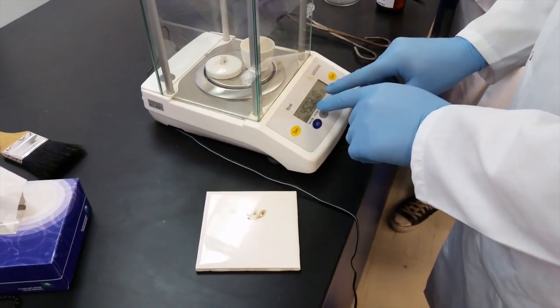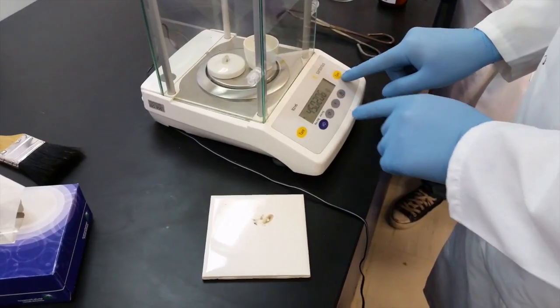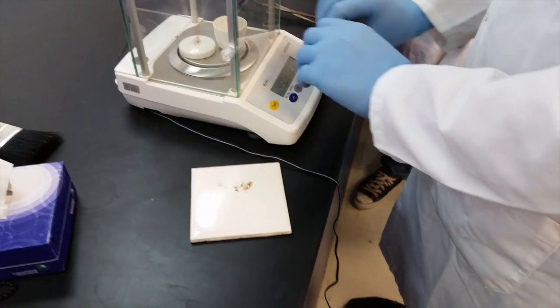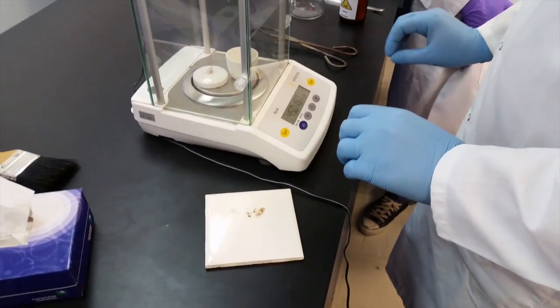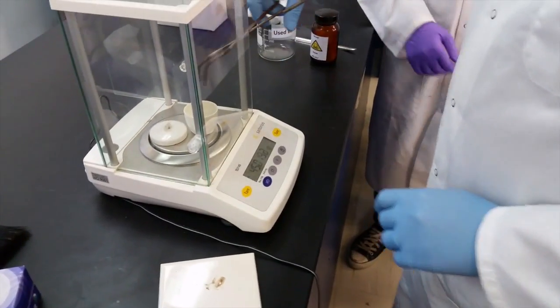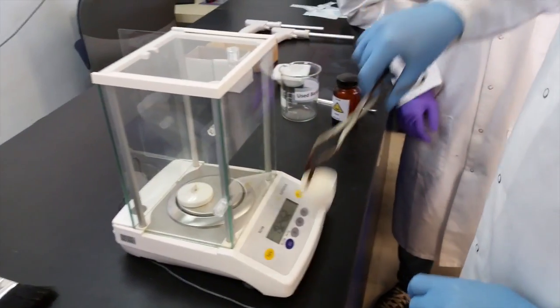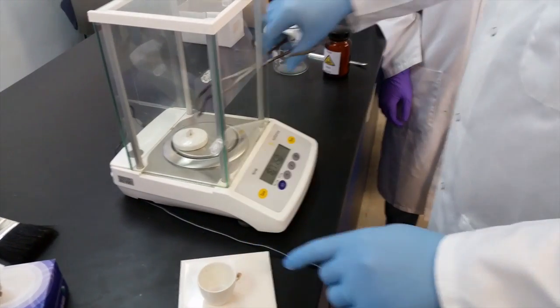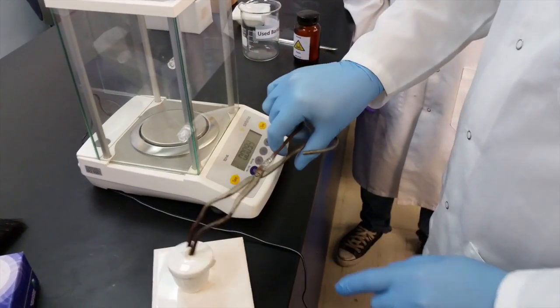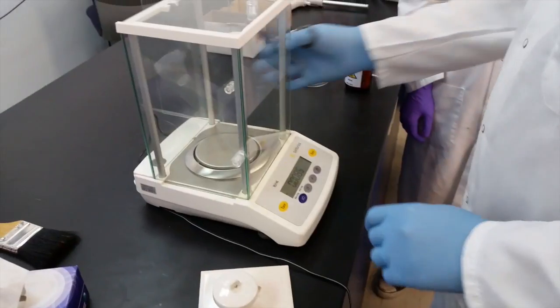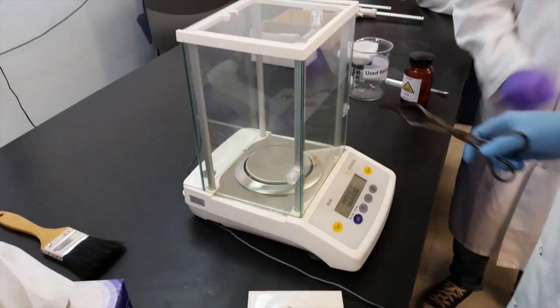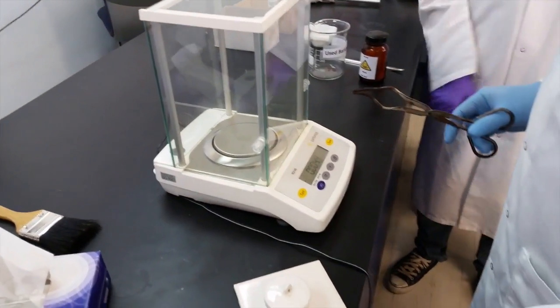If you noticed, when I added my solid I did not hit tare. You never hit tare - you only use it at the beginning. By subtracting the mass of empty crucible from the mass of crucible and salt, I can get the mass of hydrate before heating.